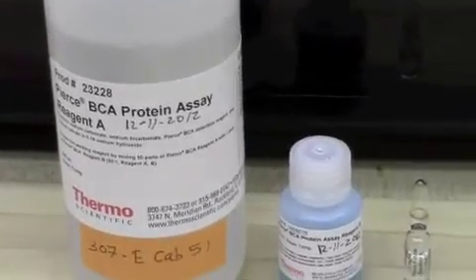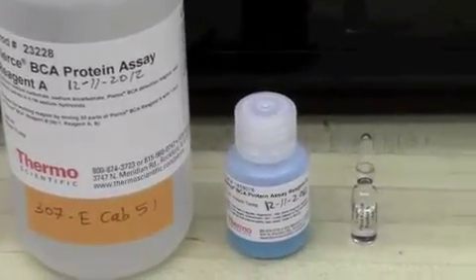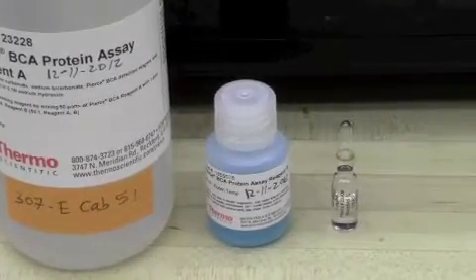You will need the Pierce BCA Protein Assay Kit, complete with Reagent A, Reagent B, and an ampoule of BSA, as well as two microtiter plates.